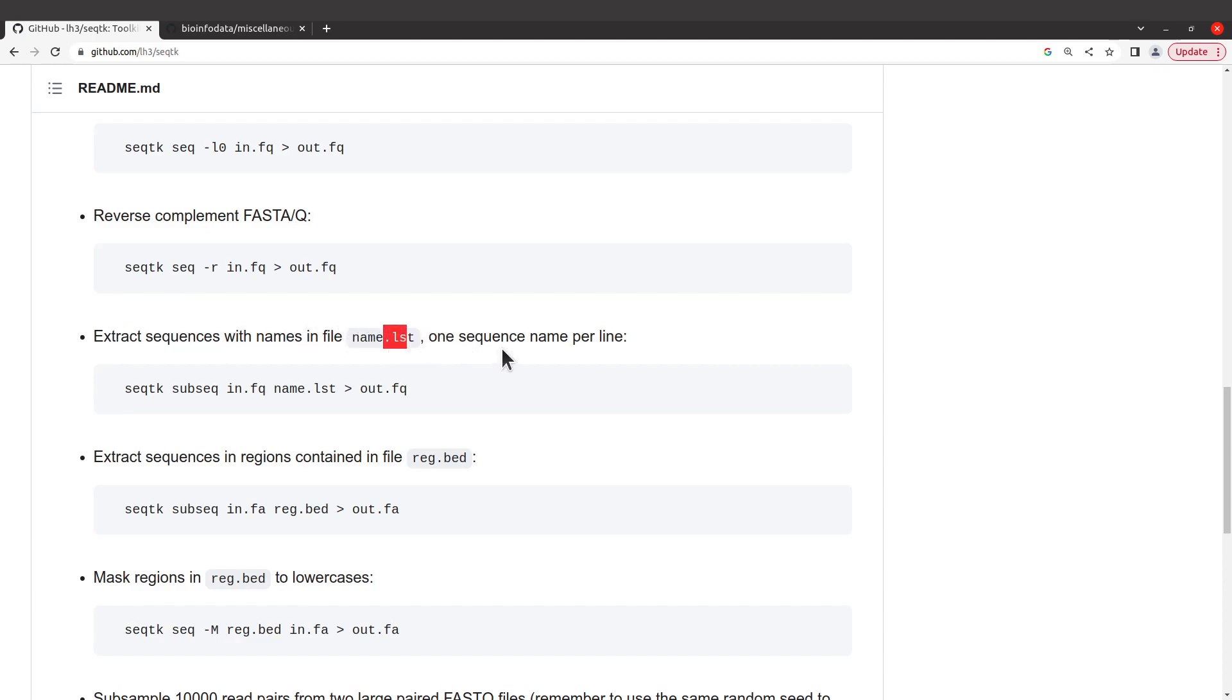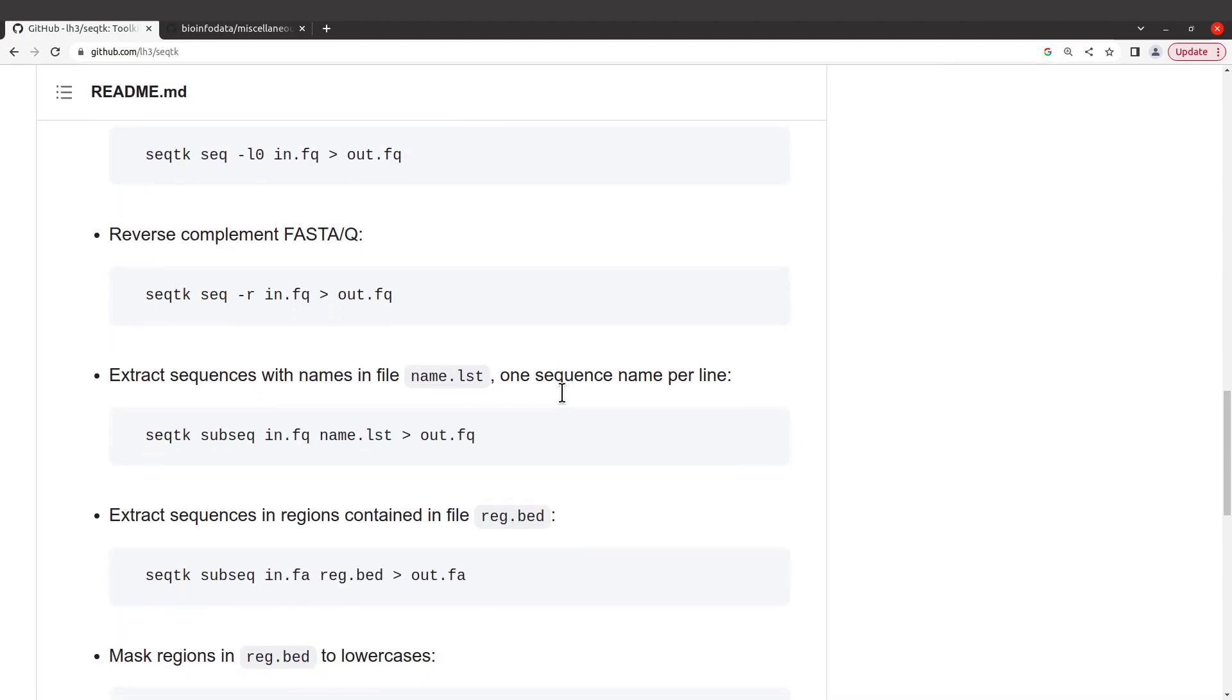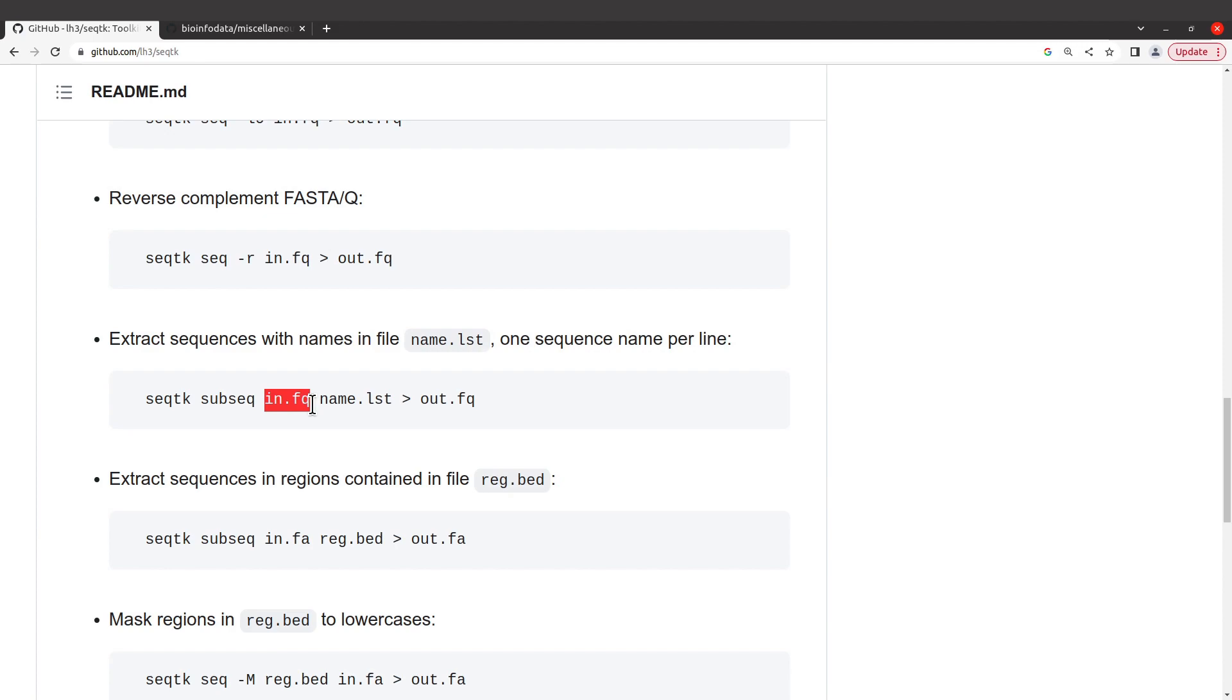Extract sequences with names in file. This is the syntax. We need to call seqtk and we also need to indicate this option subseq and then it's supplied with an input file. This can be a FASTA file or FASTQ file, but for this tutorial we are going to use a FASTA file.